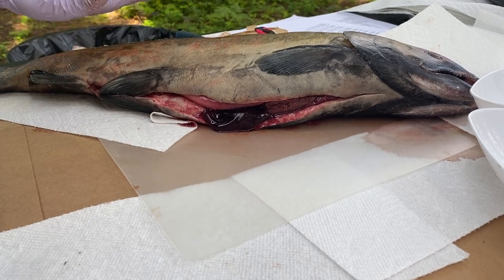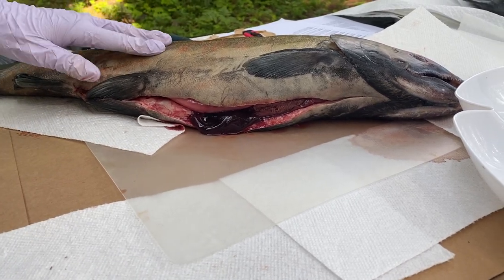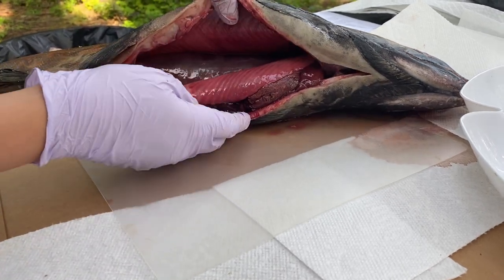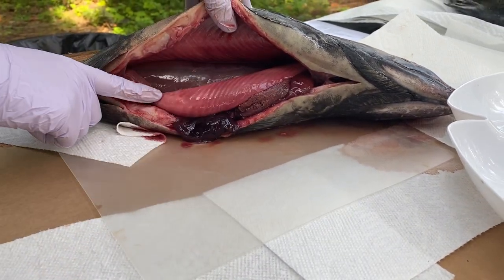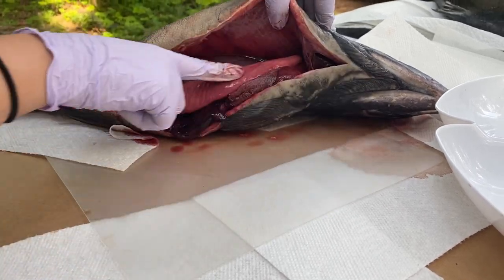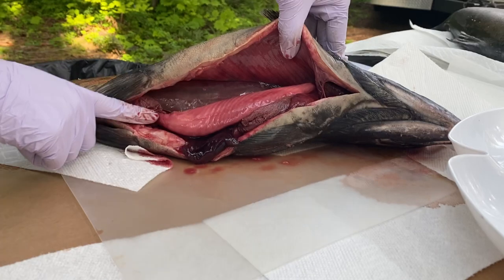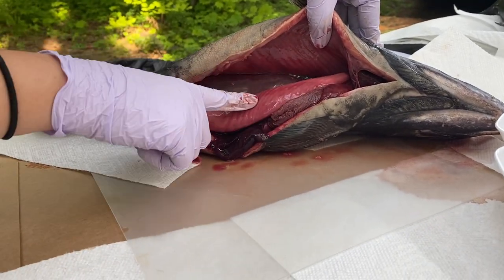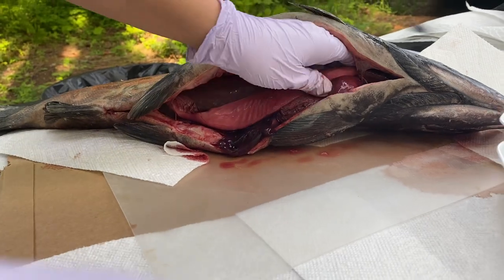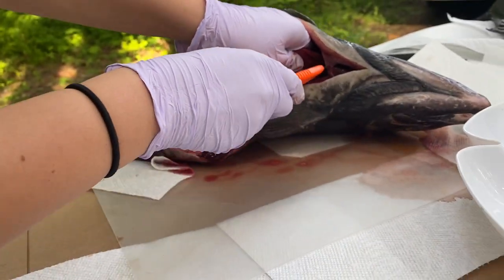It's kind of interesting, but usually the males are about the size of that really big female that we saw before. So the first thing we see when we open up the salmon is this really big long structure right here. Since this is a male, and how I knew is because it's a really long, big structure, this is the salmon's milt sac. This is where that liquid that fertilizes the eggs, called milt, is made. And so I can cut it out carefully.